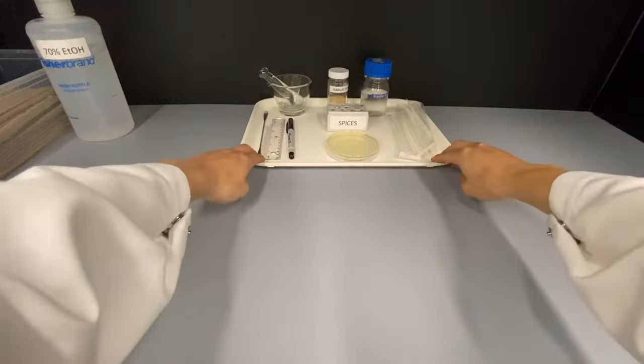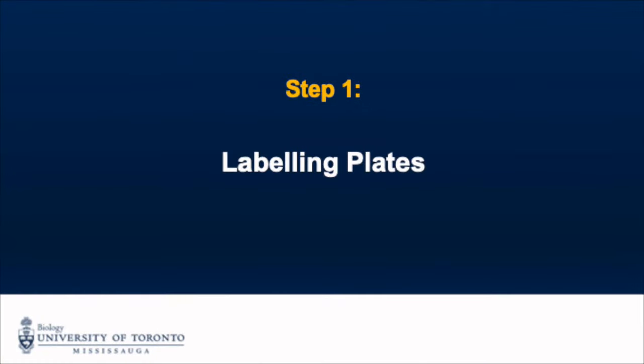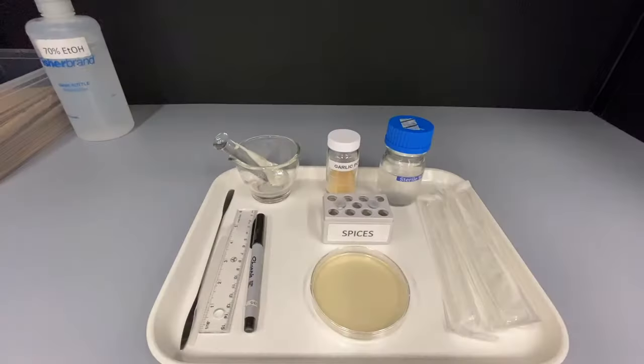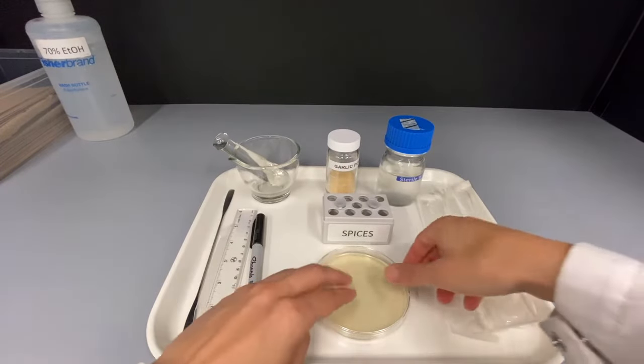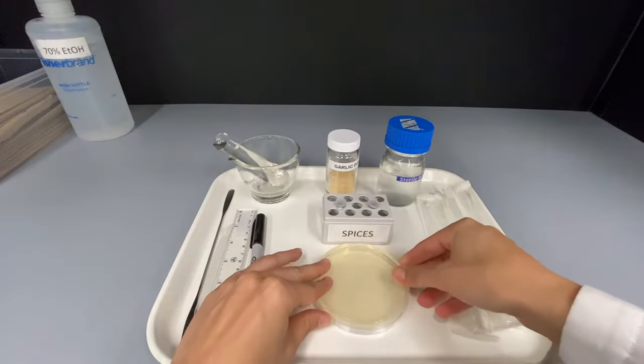You will start with the materials from tray 1. The first step is to label the agar plate. Your plate has two sides, the bottom side containing the agar and the lid. You want to label the bottom side.